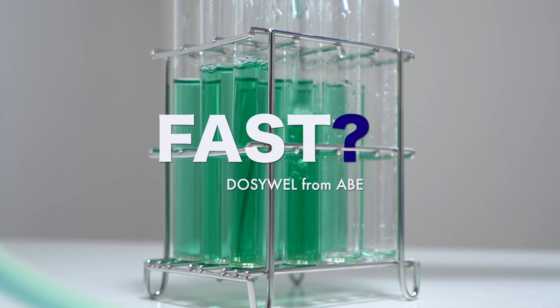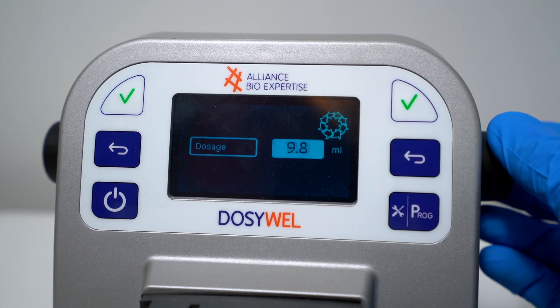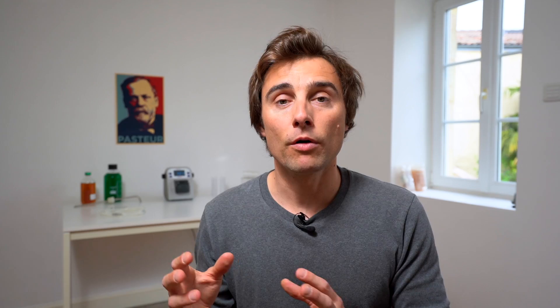So we are going to focus on two things: is it fast enough to be better than you manually? And we are going to check as well, is it flexible enough to be moved from a room to another, to switch from one format to another?